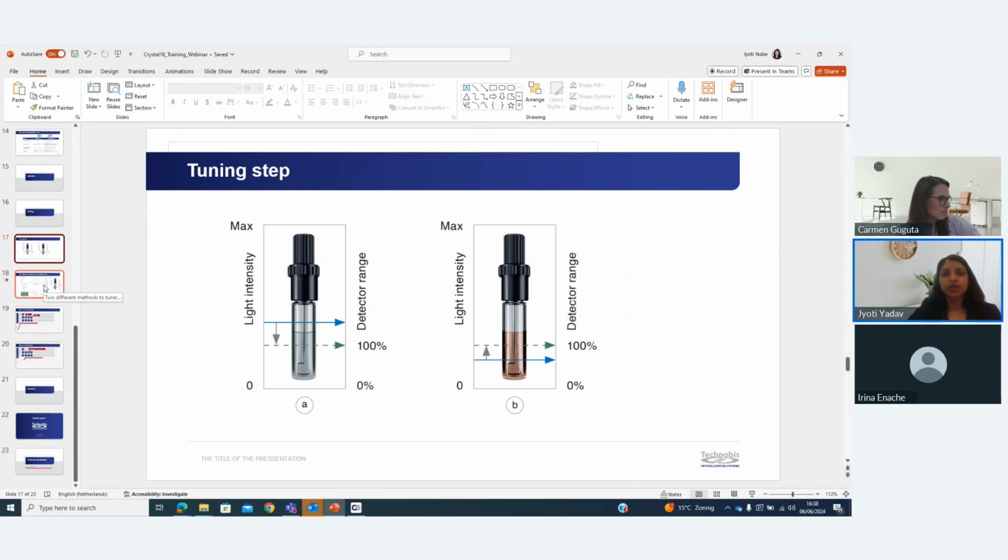then it is recommended to use the solubility at room temperature. You can do a visual check: take 1 milliliter of your solvent and slowly add a little bit of the compound, shake it, let it go into solution, add a bit more, and then you know more or less where you are at room temperature.